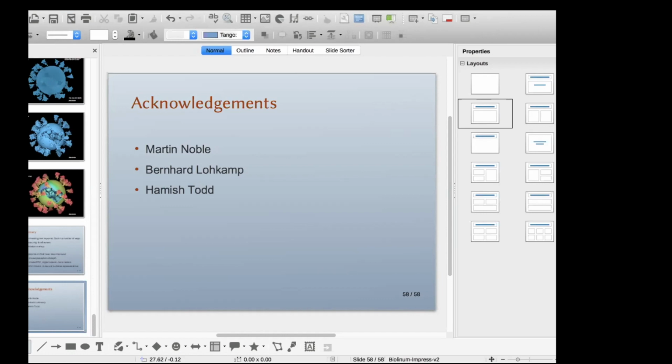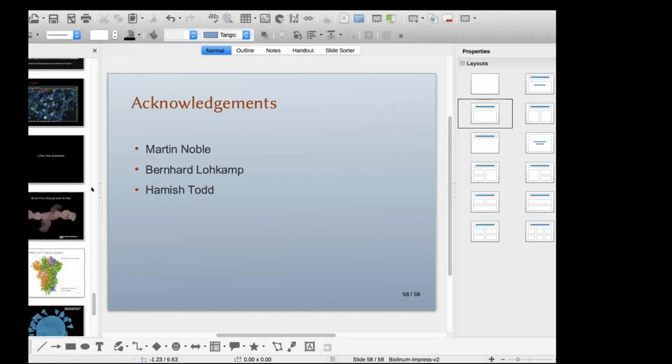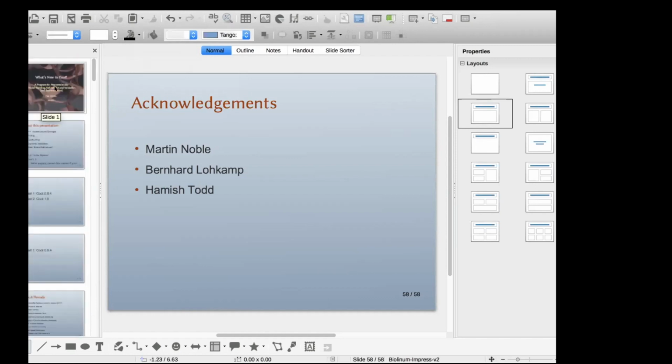We had one question about exporting 3D files for electron density maps. Is the new version going to be able to export 3D maps in various formats? Yes, indeed. So the very first image that I showed you, this one, can you see that you're sharing?